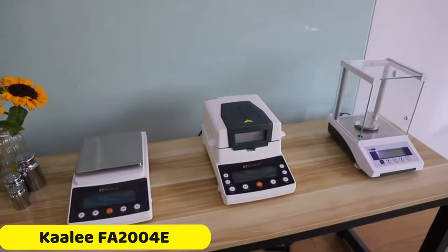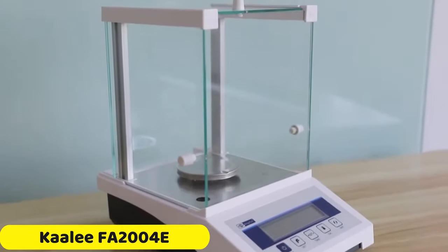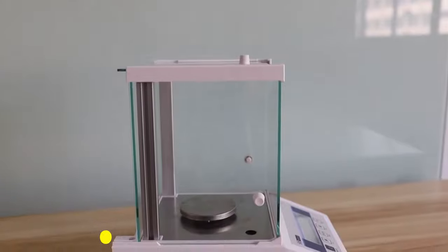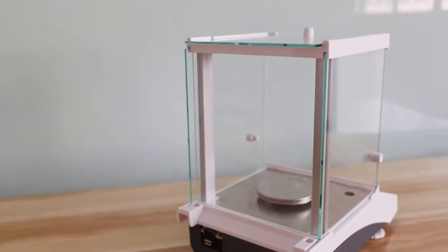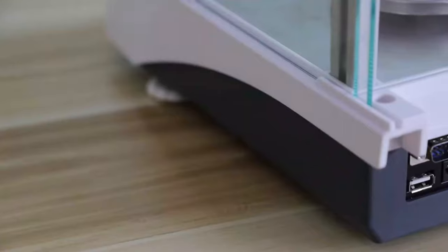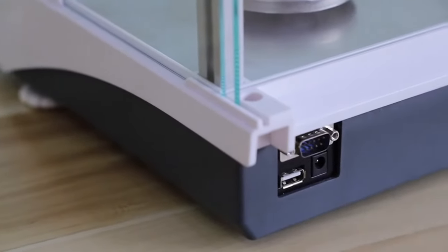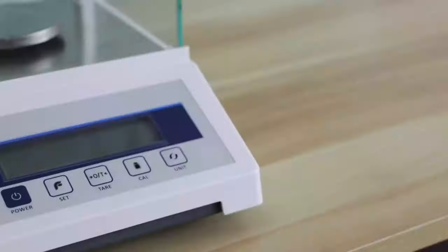Number 2: Kaalee FA2004E Analytical Balance. The Kali FA2004E Analytical Balance is a precise, reliable, and user-friendly laboratory balance from mainland China. Its sleek design and robust build ensure durability in demanding lab environments.